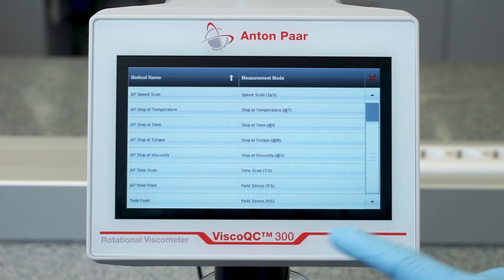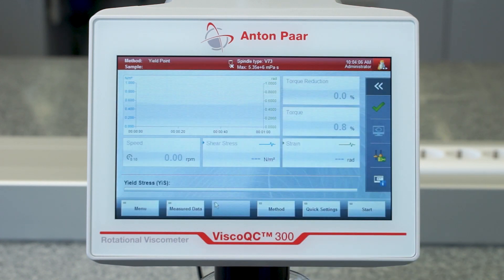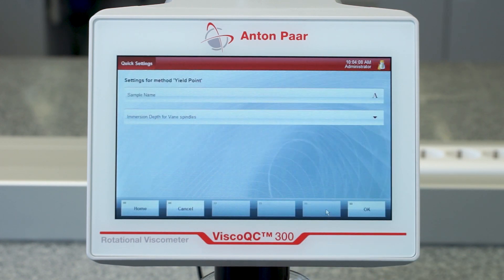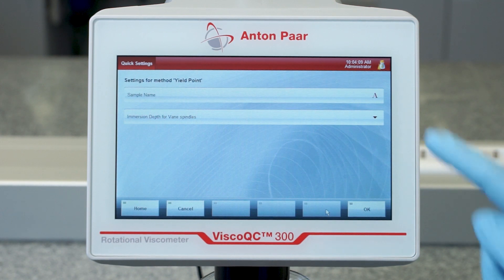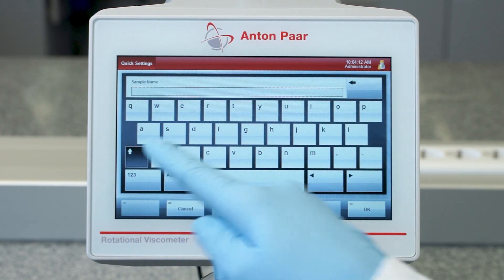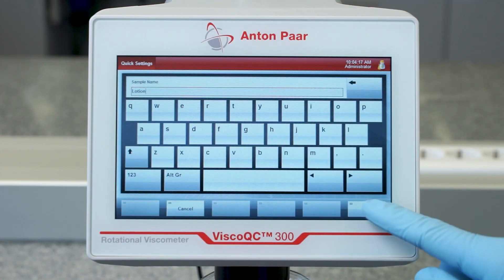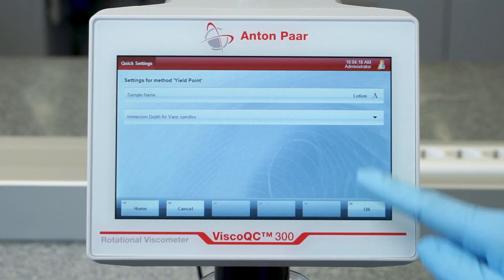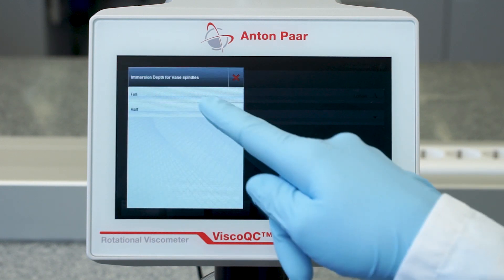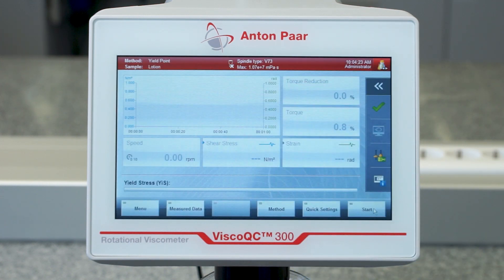Go back to the main screen and choose your method. Insert a sample name and the immersion depth of the vane spindle that you would like to use for measurement. Tap Start to begin your yield method.